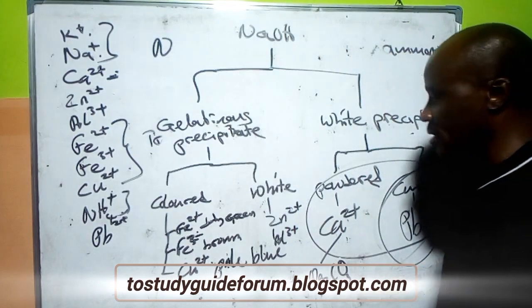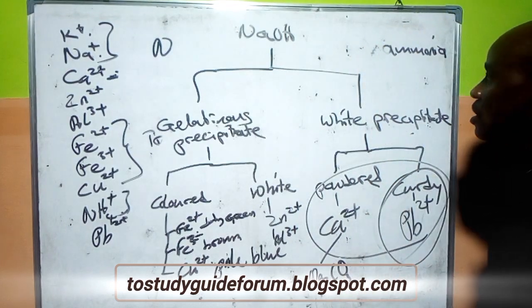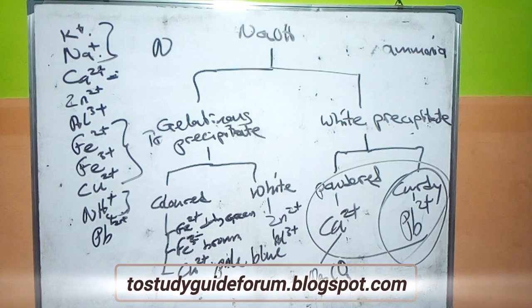The next one we'll be looking at now will be the test with aqueous ammonia.